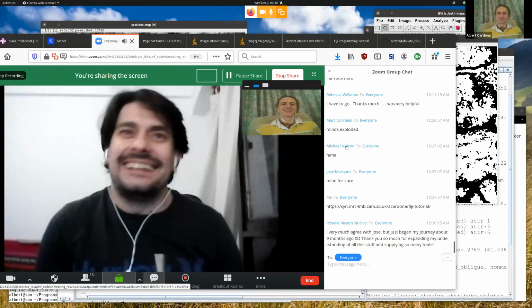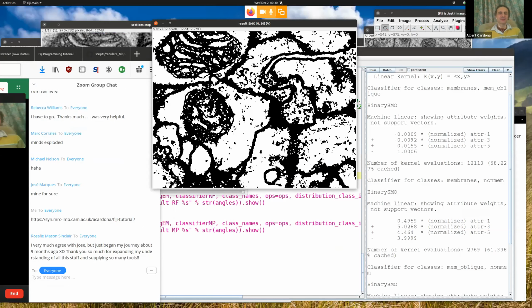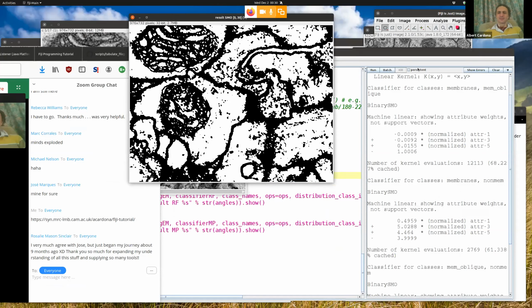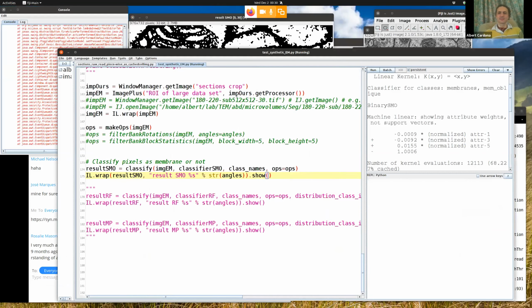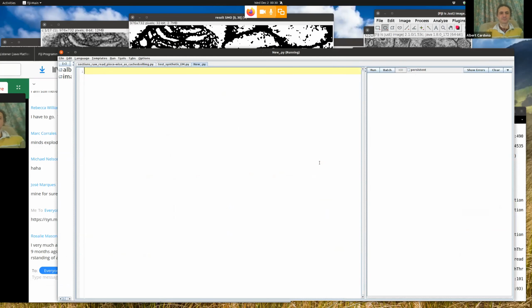Yes, please. So here, for example, we have these images open, right? But I didn't do the persistent checkbox, so I don't have a handle onto them. Well, that's fine. We can do it even from the comfort of a script, where I have expansion.